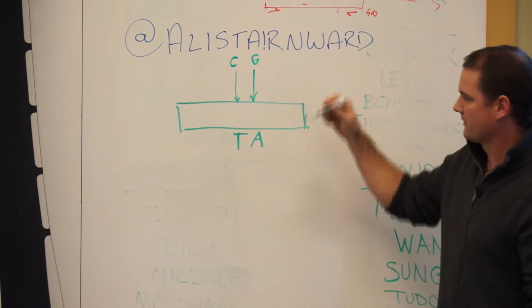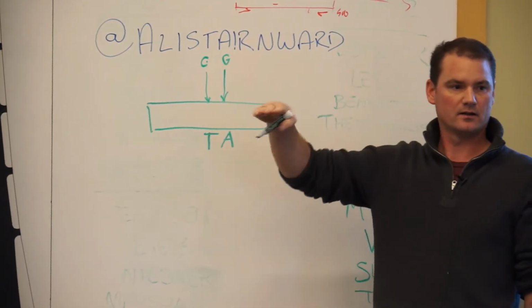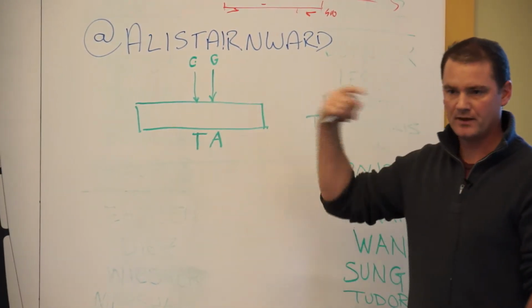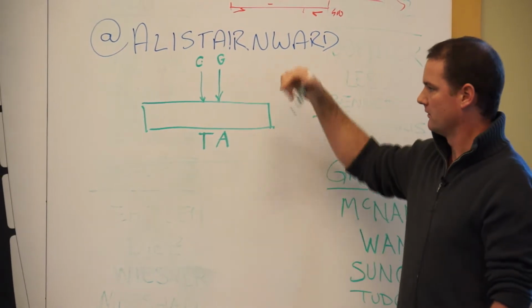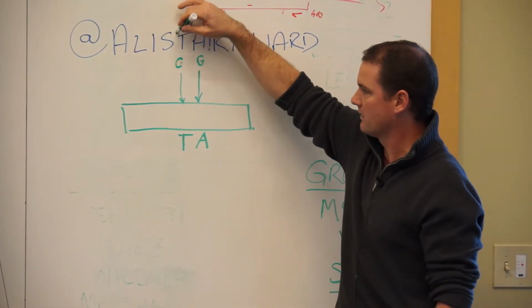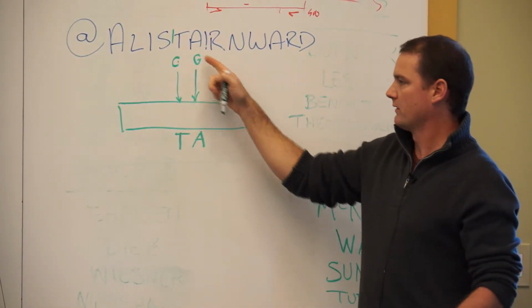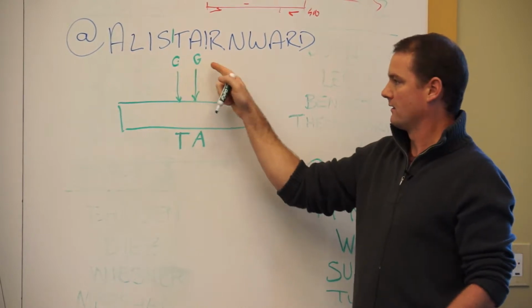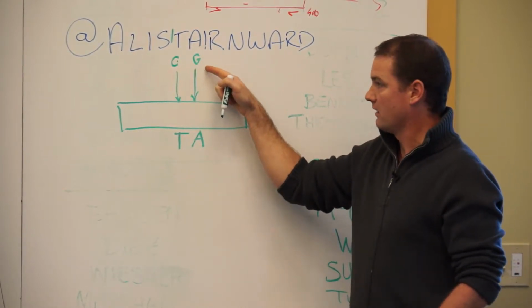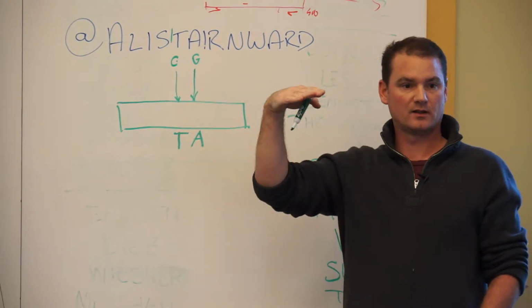The problem is that each of these changes is going to be a single record in the VCF file. These tools predict the consequence of each of these changes on their own. But what you really want is this: you can tell from the sequencing data that these two polymorphisms are on the same haplotype, or on the same allele.